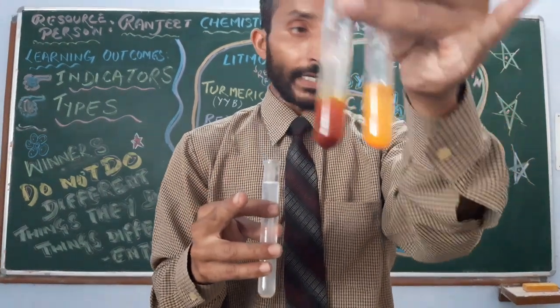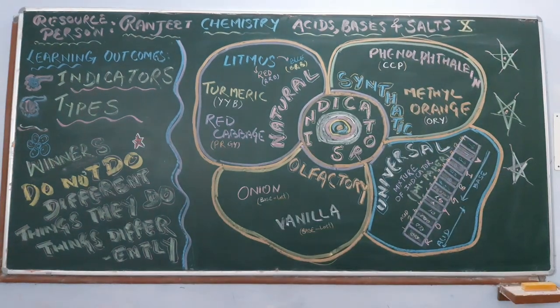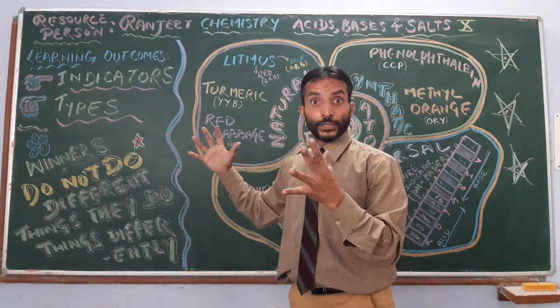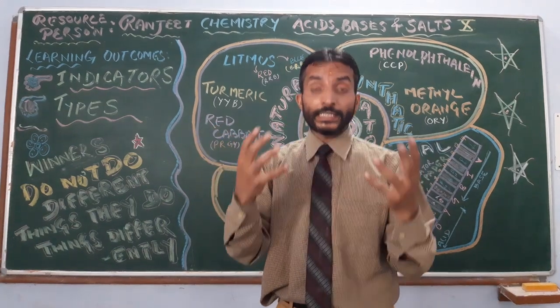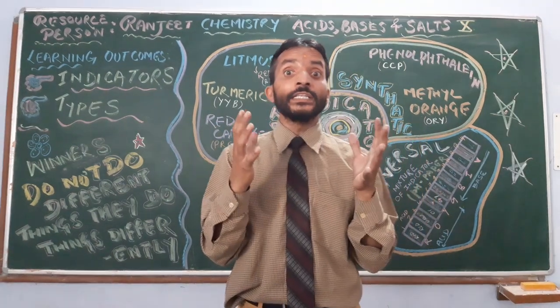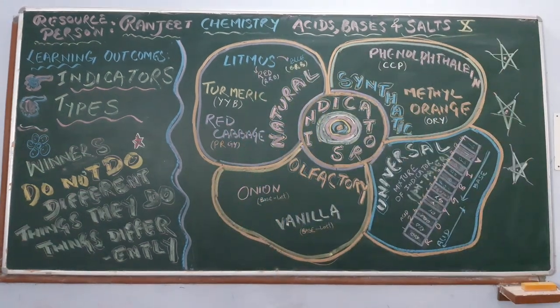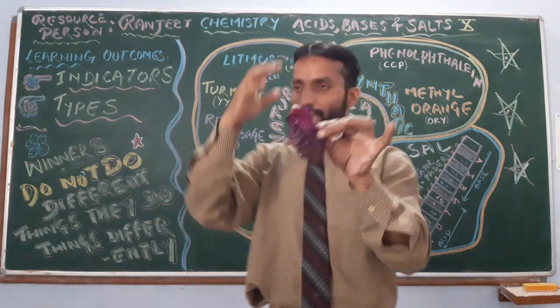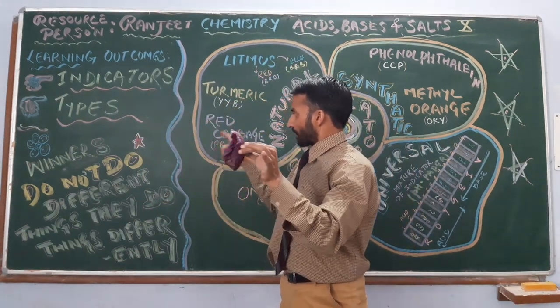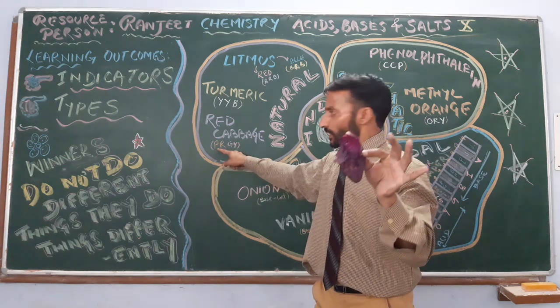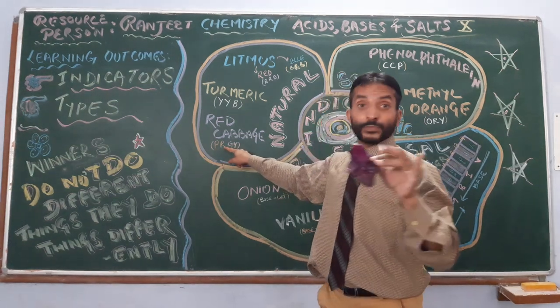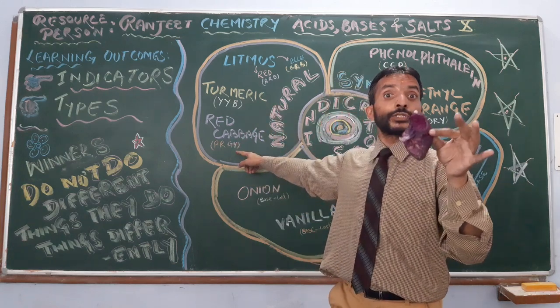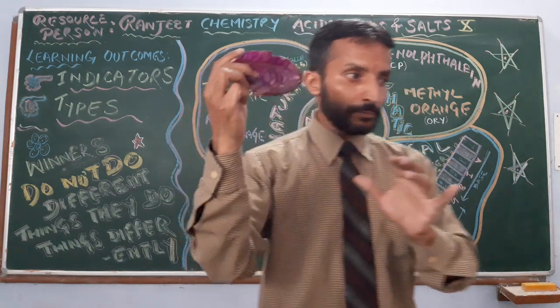This is about turmeric. Next is red cabbage — red cabbage is also a natural indicator. I will extract its juice. It is purple in nature. In acid it becomes red, and in base it becomes greenish yellow. Let us have a practical observation.